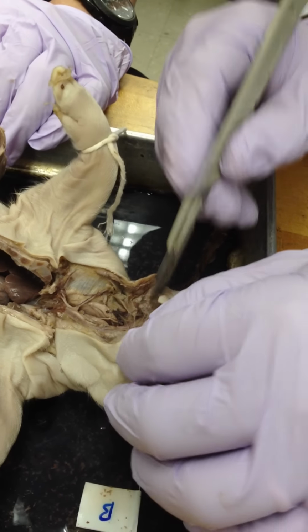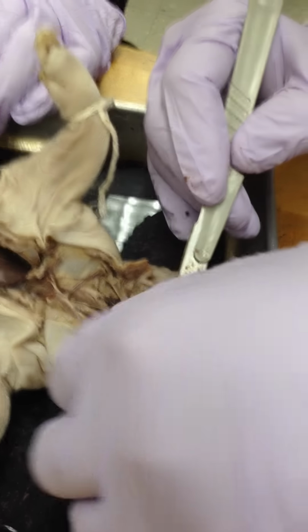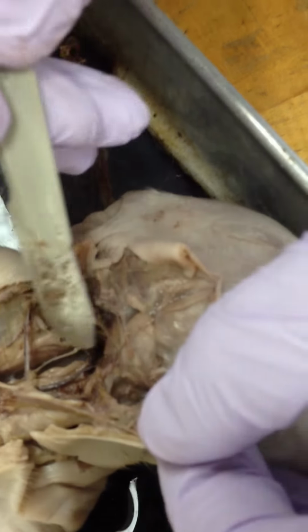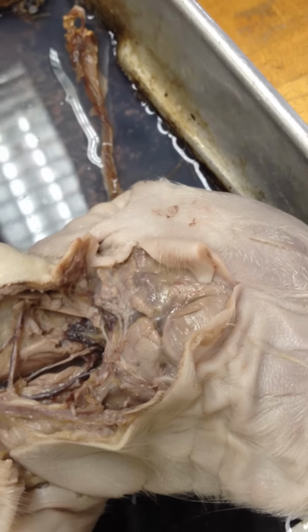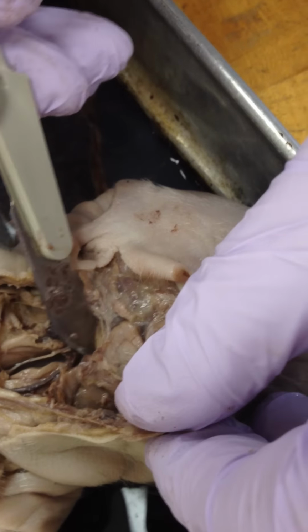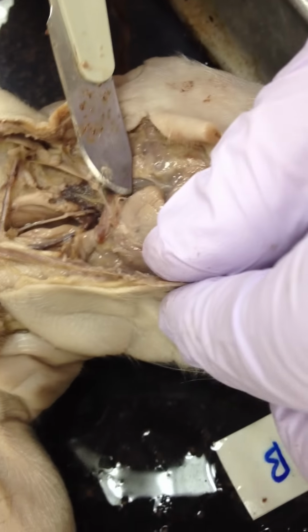Okay, so I don't have all the types of salivary glands. So there you go. I think that's it right here. Which one? That guy there? Oh, this guy. And see, it's like it shows up outside the oral cavity. And it's responsible for secreting a lot of the salivary fluid, which is watery, not so much mucus.